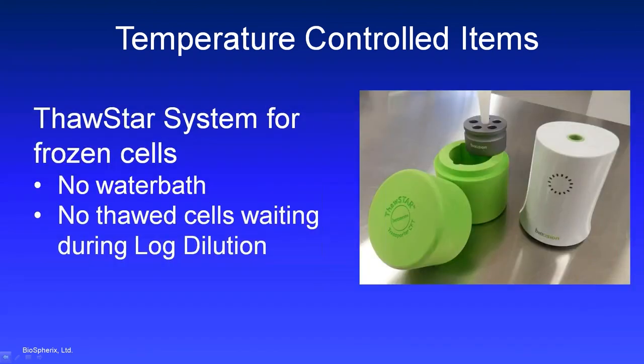Now, if you want to thaw cells inside the Xvivo system, and we encourage you to do so, one particularly good technology to use for this is the ThawStar system.